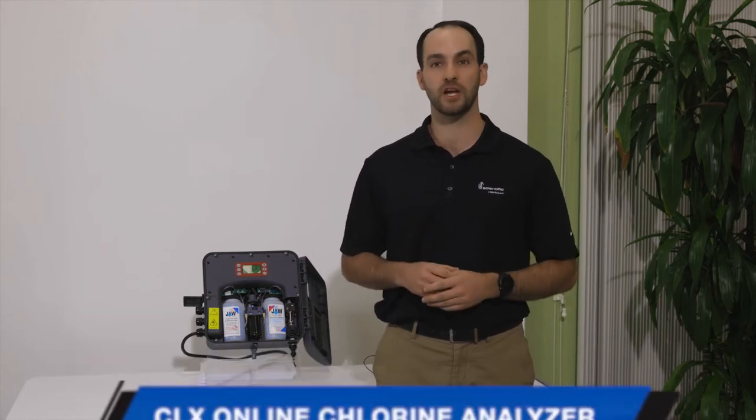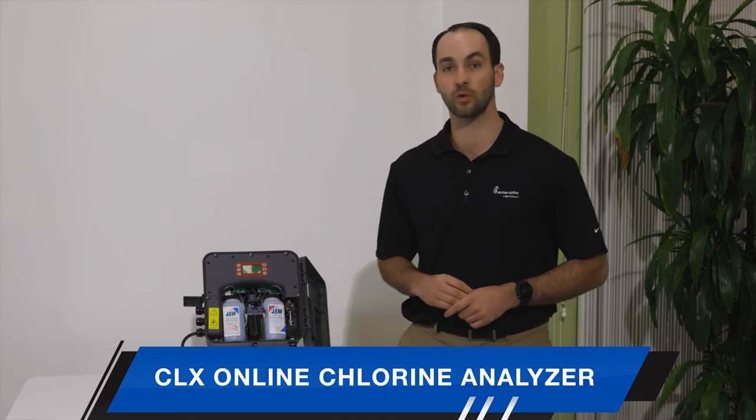Hello, my name is Eric Dibble. I'm a Regional Sales Manager at HF Scientific. Today we're going to do a short video explaining how to do the monthly reagent change on the HF Scientific CLX online chlorine monitor.